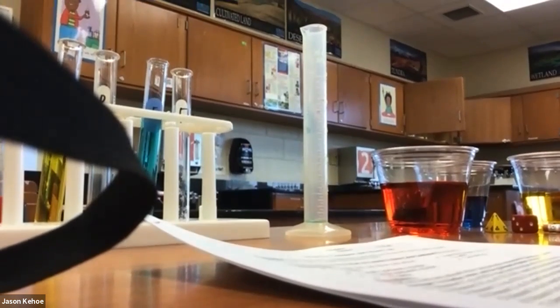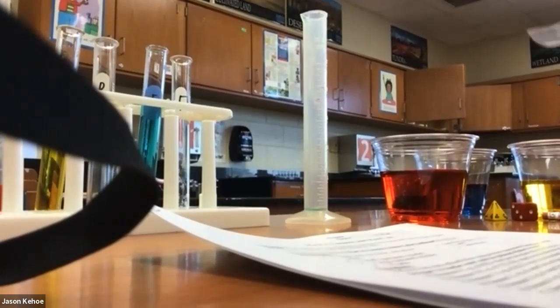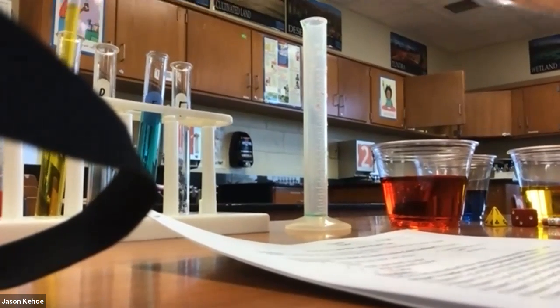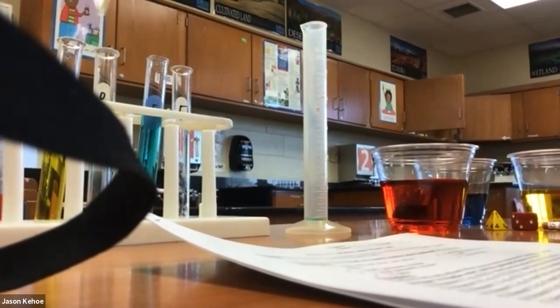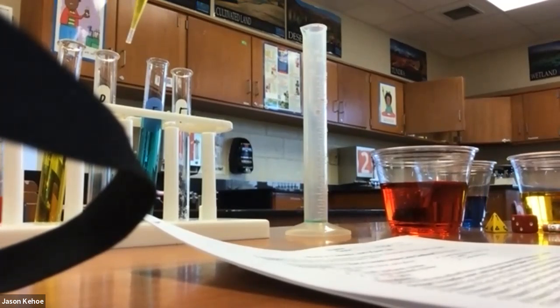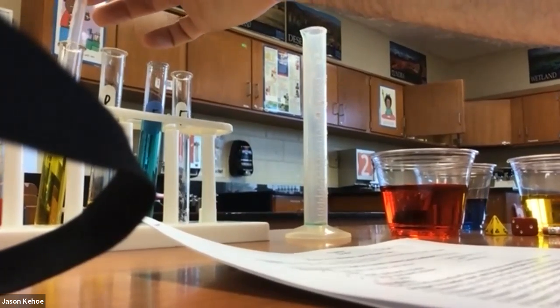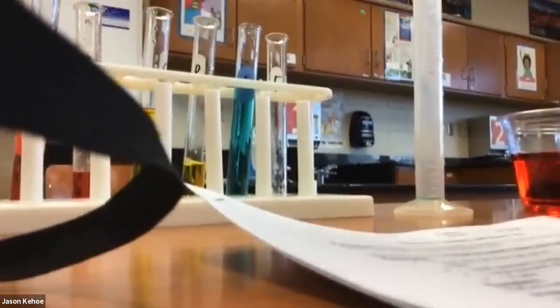All right, now measure 3 milliliters of water from C and put it into D. Again, I think I'm going to do 2 milliliters and then 1 because I can't seem to squeeze it hard enough to get higher than 2. From C into D, there's 2 and 1.